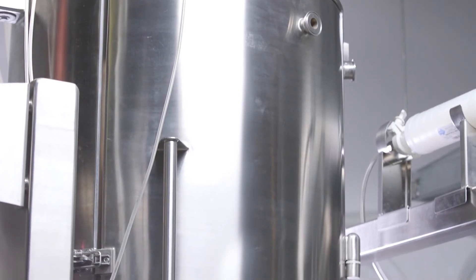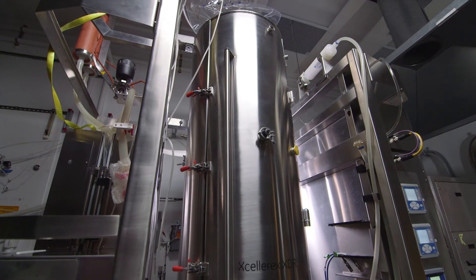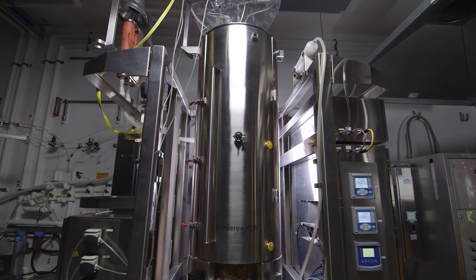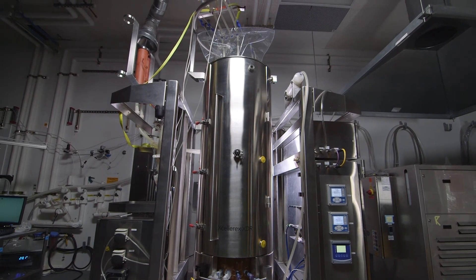The use of disposable fermenter bags will reduce batch changeover times by eliminating time-consuming cleaning and validation. The net result is more batches produced in a given time period and the opportunity for higher profit.